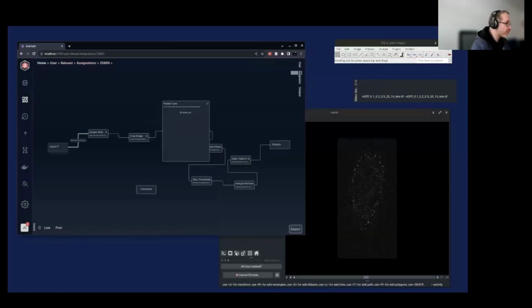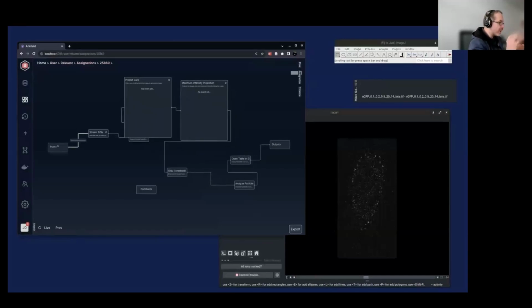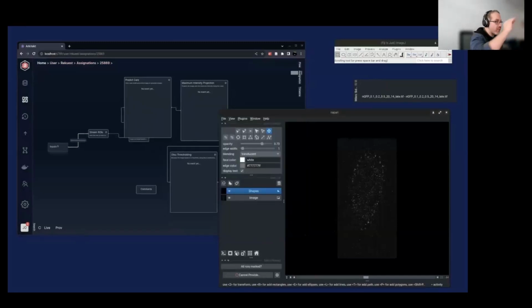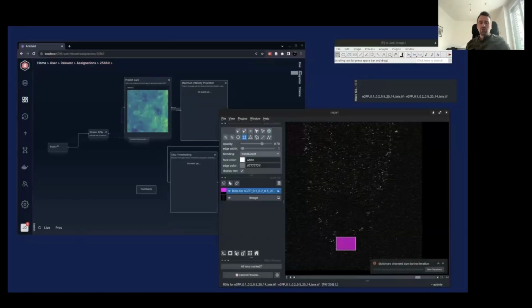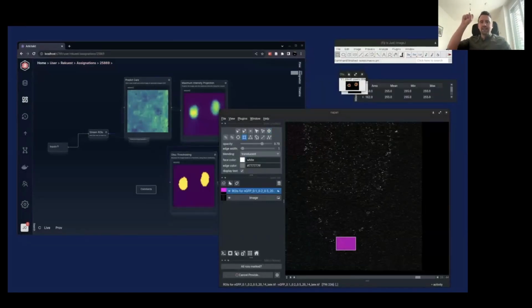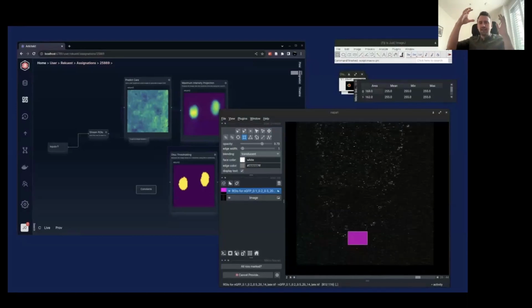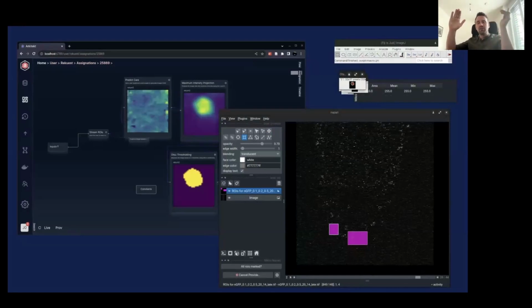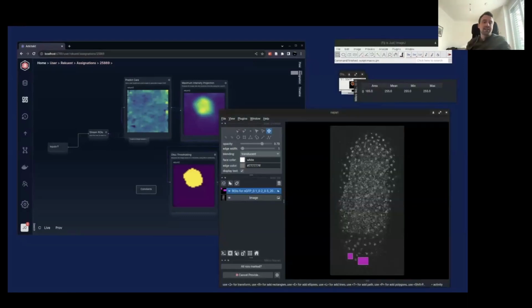Yeah, and this is exactly the same question in the chat. We need to first fine tune it. If you have an already working pipeline, you know it will work, so you do it and you apply it. But we need to first construct it and check it before applying it. Yeah, so you can also run every node by itself. But the magic, I really feel, is why I put a lot of effort into making these apps standalone. It's Fiji as you know it. If you load something into Fiji, you can do whatever you want. At the end, you just need to say, send it back. So that is definitely possible.